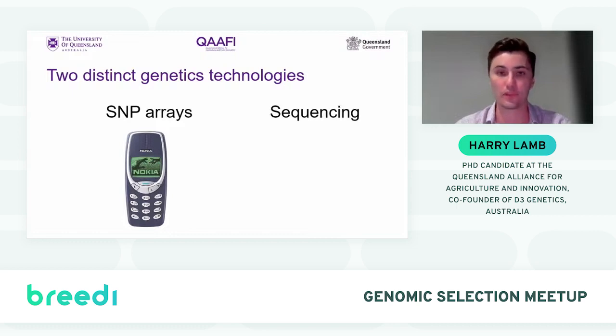The alternative technology we have is called sequencing, and sequencing provides a lot more data and information. We can get information from whatever DNA we put onto a sequencing machine, whether that be cattle DNA or potentially bacteria or viral DNA. So we get a lot more information from this, but in the past, it has been a lot more expensive.